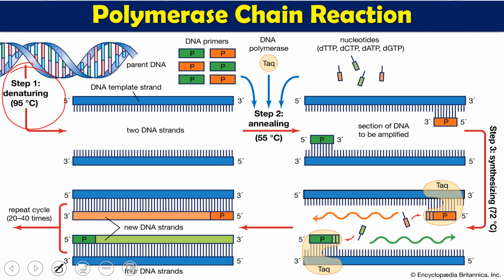This is the first stage, where denaturation takes place, at roughly 94-95 degrees centigrade, where double stranded DNA is denatured into two different strands. In the second stage, this denatured DNA binds with the primer. We have one pair of primers, the forward primer and the reverse primer, and each primer binds with the corresponding denatured DNA. Then in the third stage comes the thermostable DNA polymerase, which can preferably be Taq polymerase. Other than that, we have other polymerases also, like Vent polymerase, Pfu polymerase, or Pwo polymerase, along with deoxyribonucleotides.